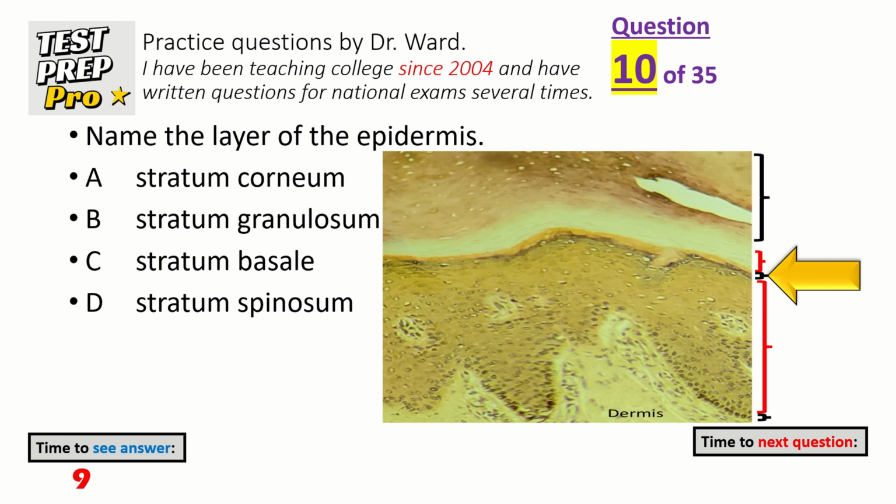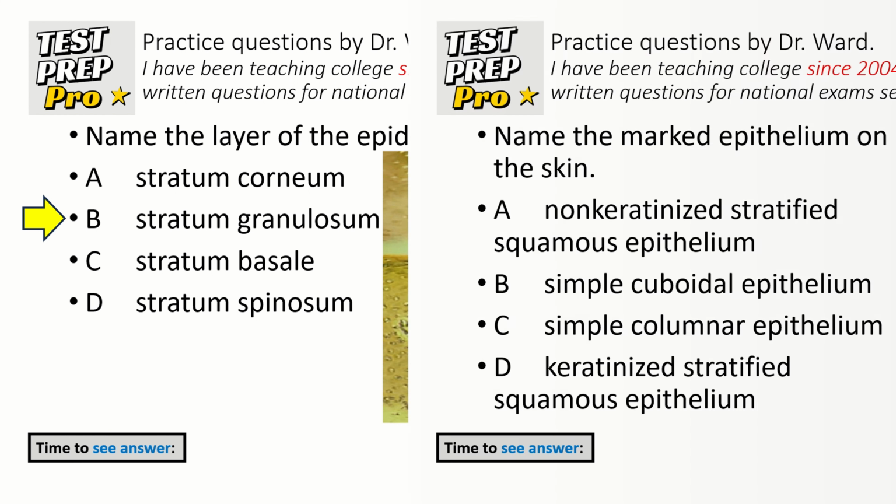Name the layer of the epidermis. It's not the top layer, but it's like 3 down from the top. Stratum granulosum. You're doing amazing. Keep it up.